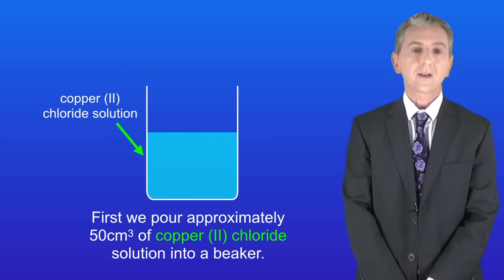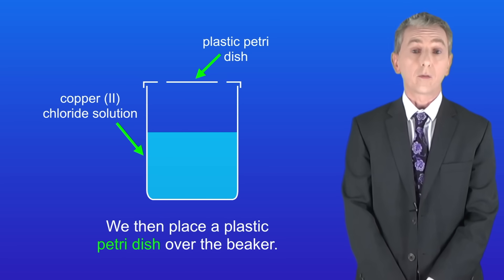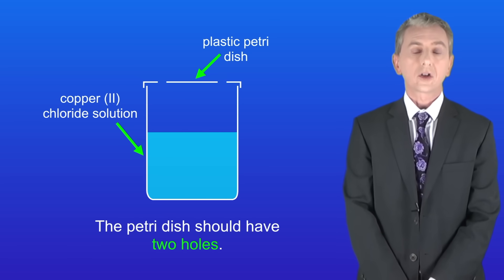First we pour approximately 50 centimeters cubed of copper chloride solution into a beaker. We then place a plastic petri dish over the beaker. The petri dish should have two holes.